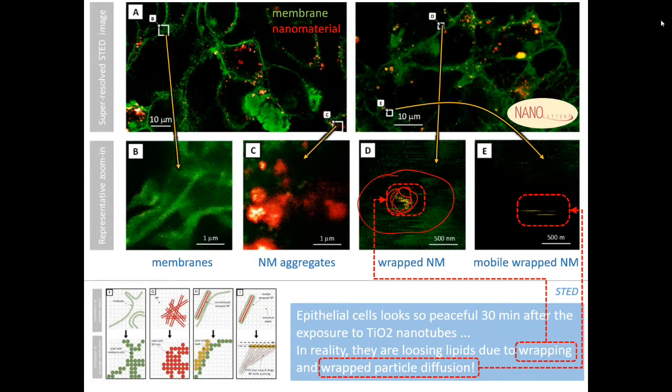Even more important is that if you zoom in through these images, you will see, instead of clearly resolved nanomaterial like in image D, horizontal stripes. These stripes are due to dragging by the scanning laser and STED lasers, which allow us to image beyond the diffraction limit.